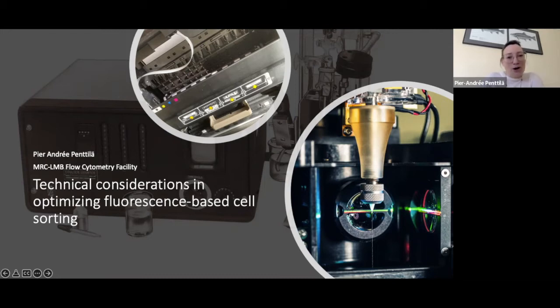There are a couple of images in the first slide that I have here, and you're probably wondering what they all have in common. I'm going to attempt to talk about that today and join all these various disparate technologies and how they formed the cell sorter.